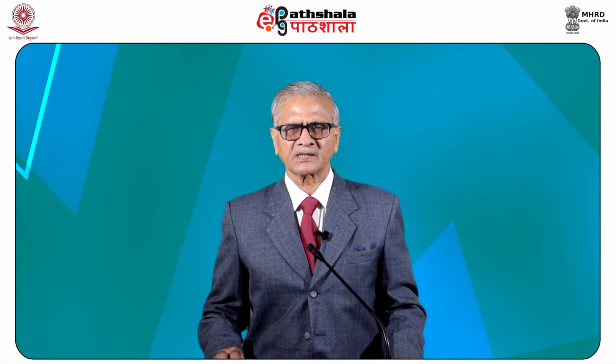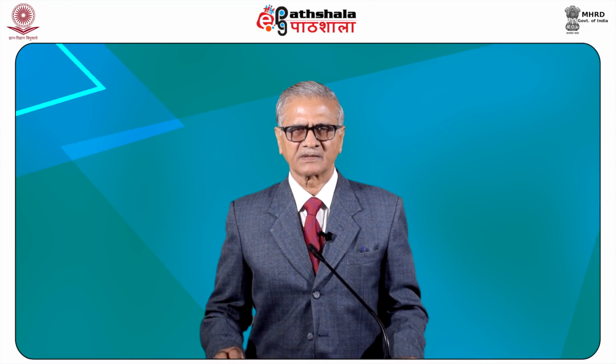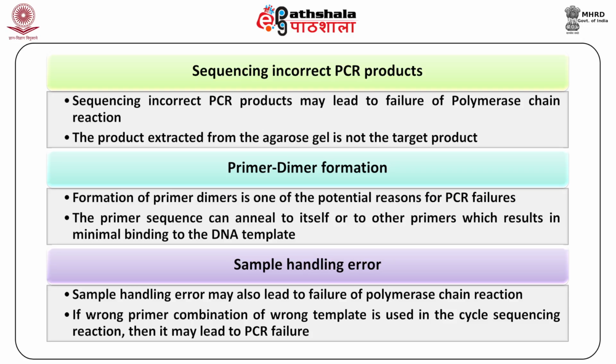Overlaying of resultant reads takes place if multiple priming sites are present and the primer binds to more than one site. Sequencing incorrect PCR products may lead to failure of the polymerase chain reaction. The product extracted from the agarose is not the target product. Formation of primer dimer is one of the potential reasons for PCR failure. The primer sequence can anneal to itself or to another primer, which results in minimal binding to the DNA template.